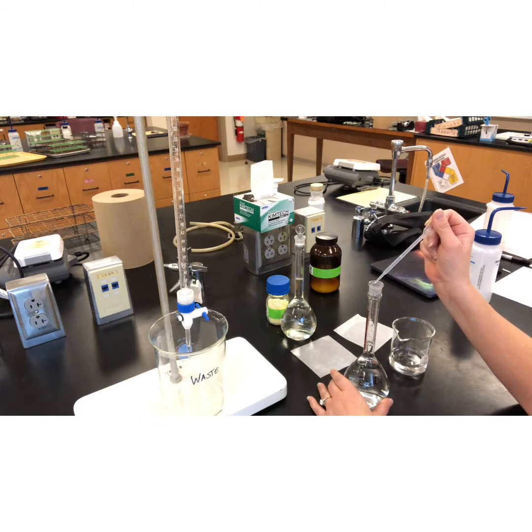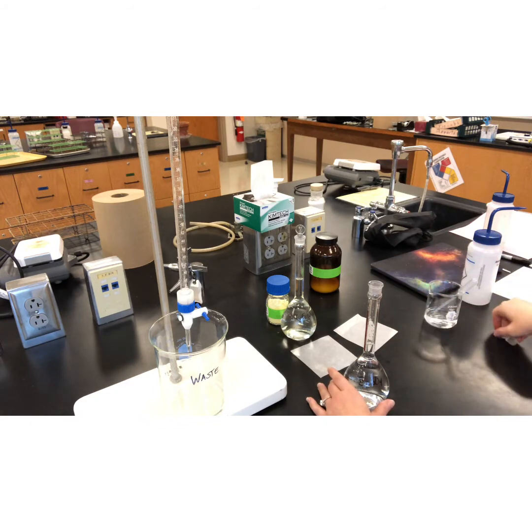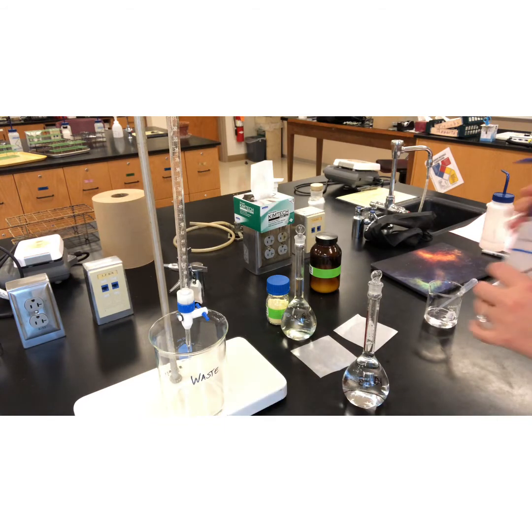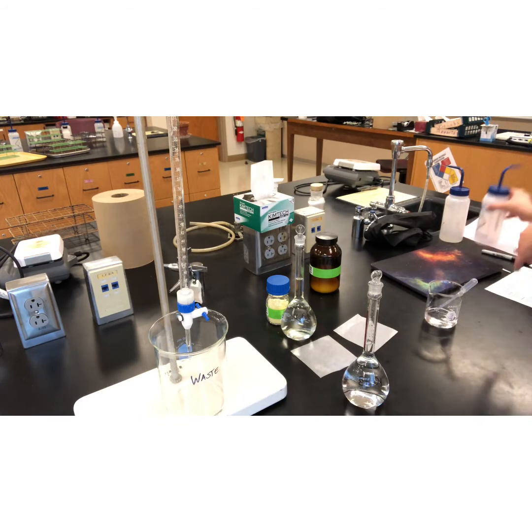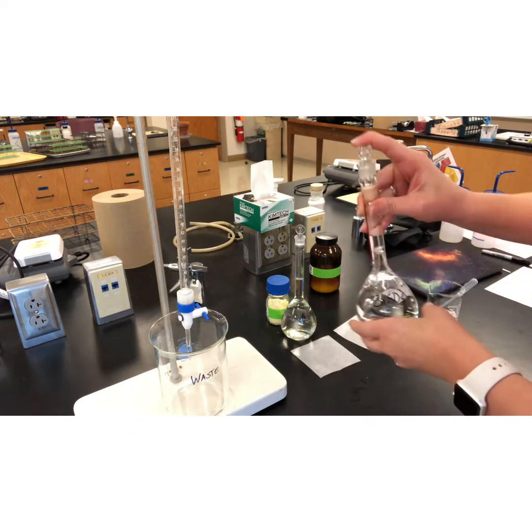Sometimes people will do it straight from the DI bottle and try to add it dropwise. But I've found that can be very easily a fatal flaw in getting your solution to be exactly where you want it. I would not recommend using this squirty bottle to do that. It's not as easily controlled. But if you like doing things twice, you do you.